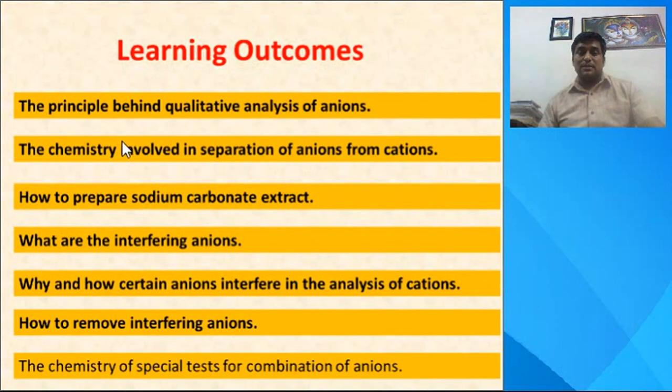So what we have learnt: the principle behind qualitative analysis of anions, the chemistry involved in separation of anions from cations, how to prepare sodium carbonate extract, what are the interfering anions, why and how certain anions interfere in the analysis of cation, how to remove interfering anions, and this last one, the chemistry of special tests for combination of anions, we are going to address in a separate session.